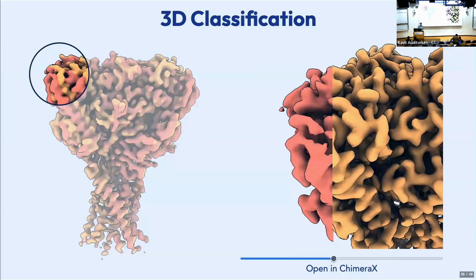So they would still have like a symmetry problem, and it might be best to go back and find new poses, as we saw here, right? The poses ended up being the problem. So it might be best to go back and try and find new poses. Of course, the problem here wasn't symmetry. It was just the general problem of ligand and whatever. So yeah, your point, I think, is right, that it works better than you might think, but still it's probably best if you think there's a symmetry problem to always stay in C1.